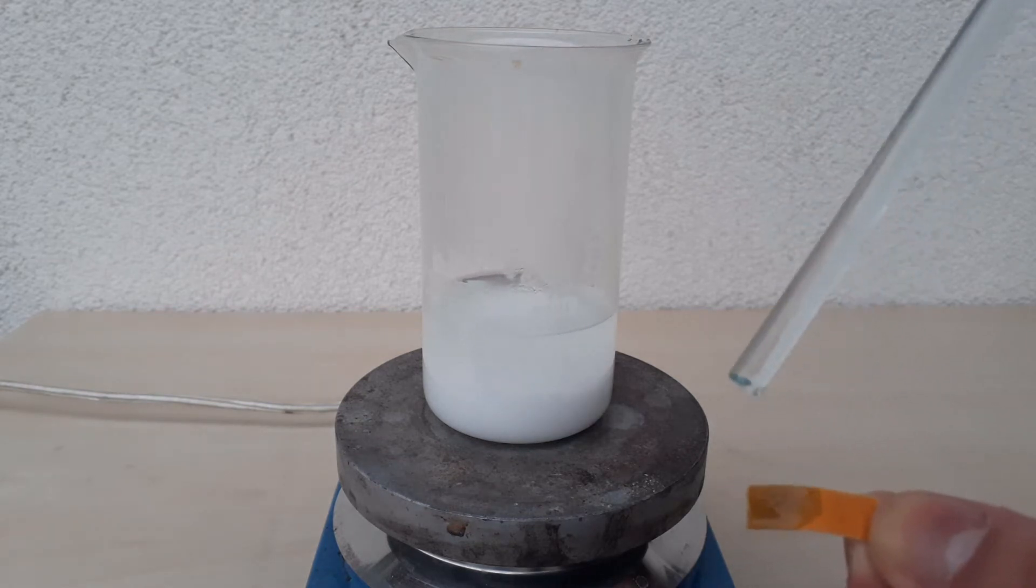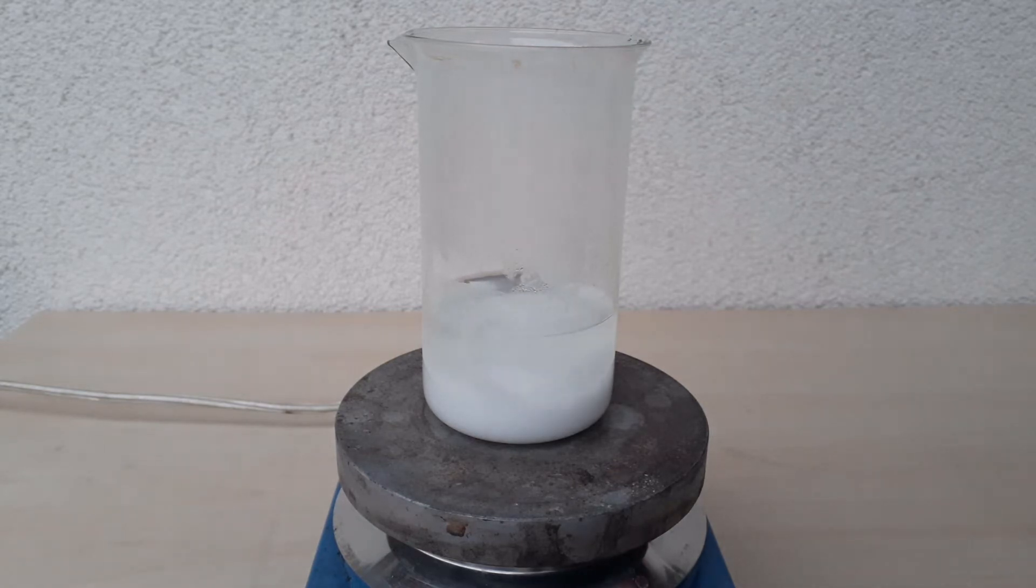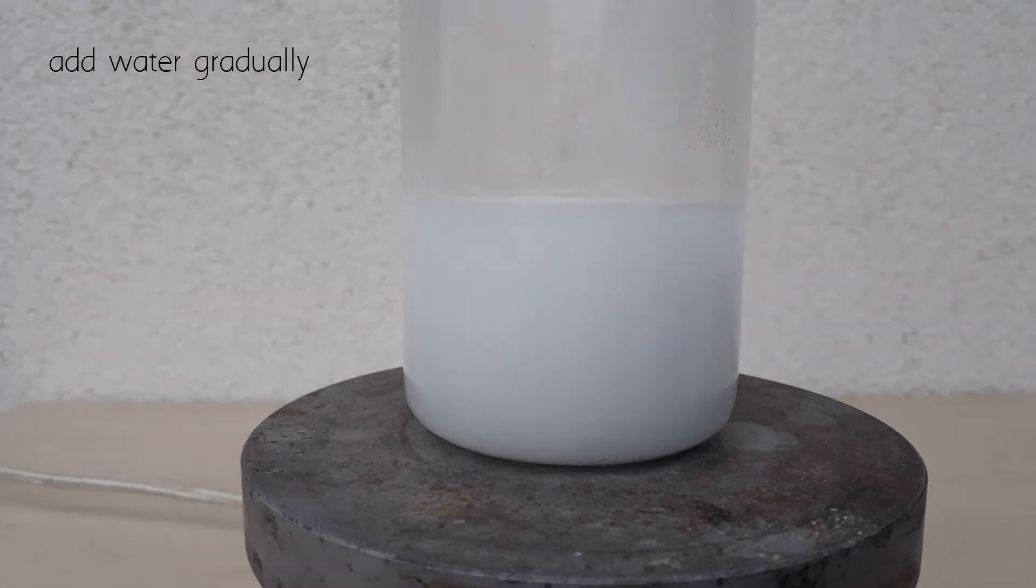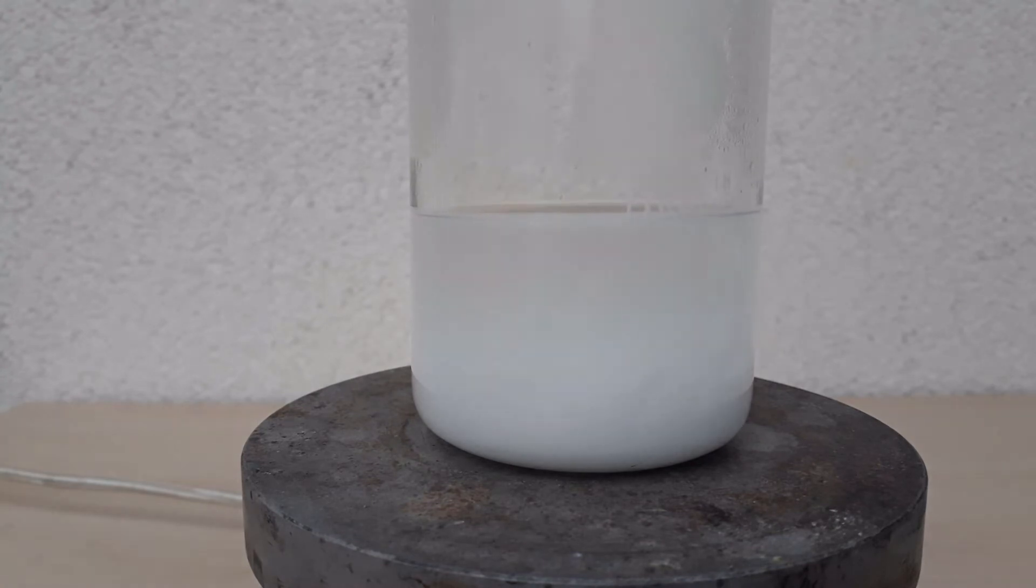I tested the pH of the solution, and it turned out that I hit the neutralization point pretty well by chance. Now I start heating up the solution until it boils, and add more and more water until all the milkiness disappears.